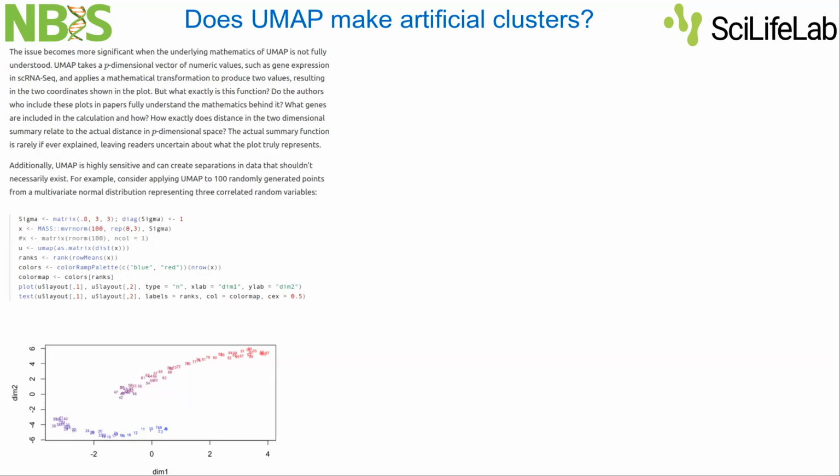Very nice explanation. So now it is clear that in UMAP, we don't preserve the distance between clusters. But yesterday, when we were doing the practice, we were talking about doublets. And sometimes doublets are bridging two populations in a UMAP. So could this mean that when we had doublets, they represent two different cells from two different populations, and they actually preserve some sort of distance in the UMAP?